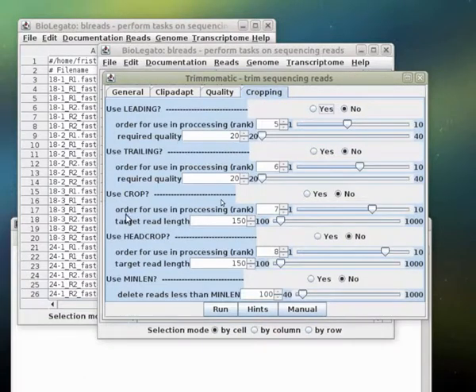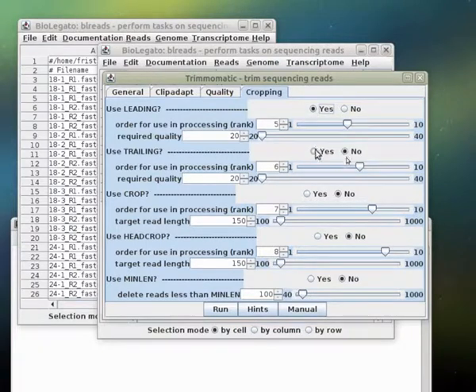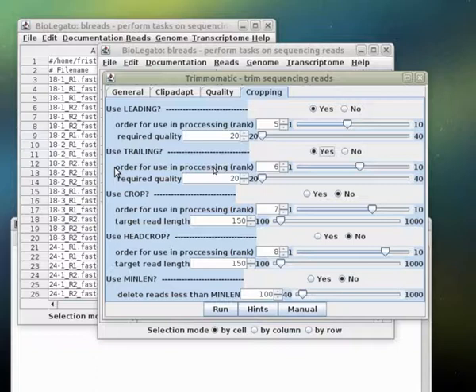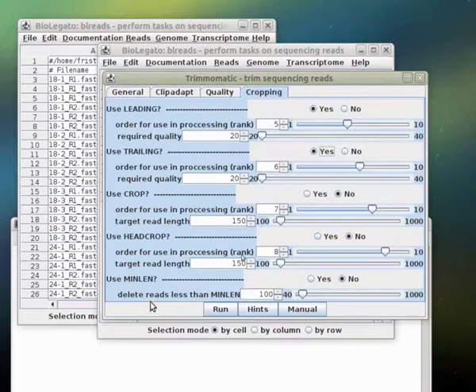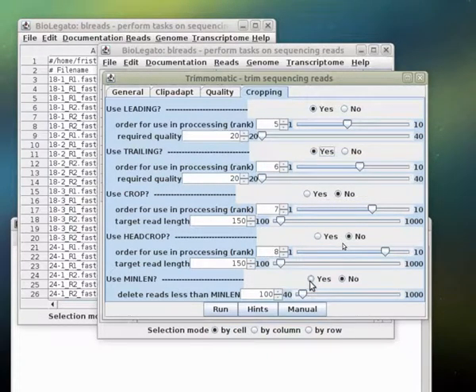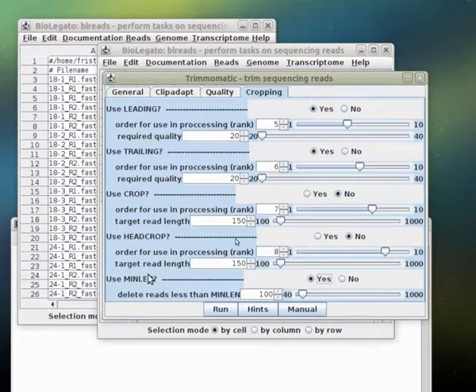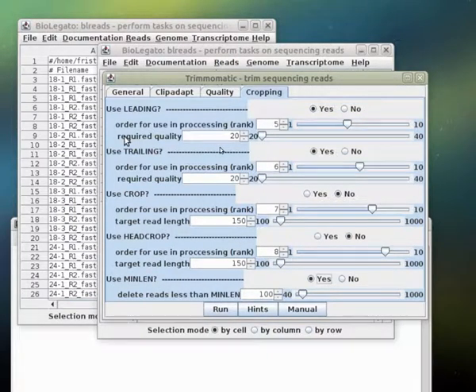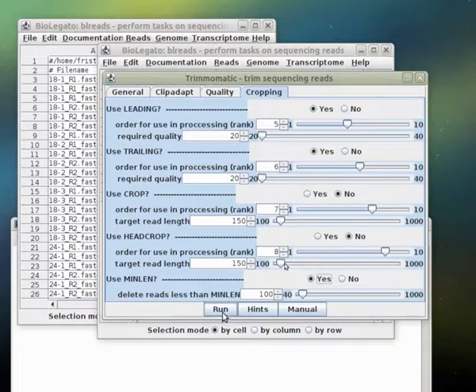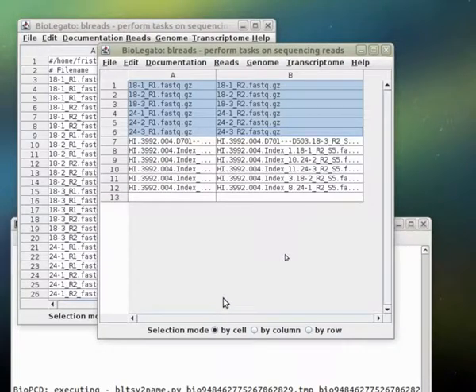Speaking about trimming, we can go to the cropping menu. We're going to crop bad reads from either the leading or trailing ends. Bad is defined as anything lower than 20, which is actually a pretty low quality score. You should always set the last parameter, minlen. In this case, we want to discard reads less than 100 nucleotides long for RNA-seq data. I'm going to launch the program and we'll see the output pop up in a new BL reads window.